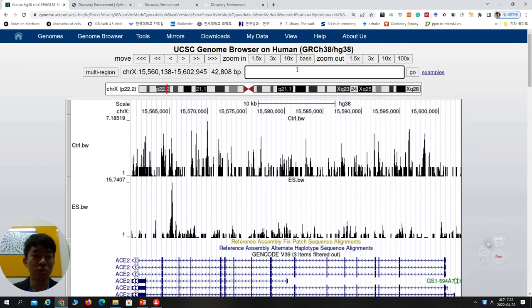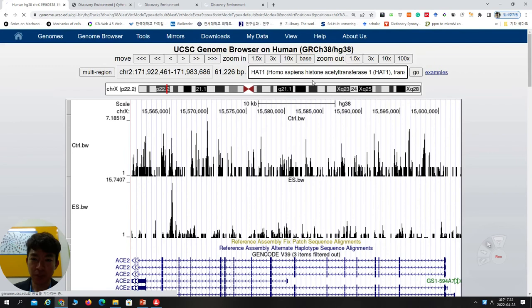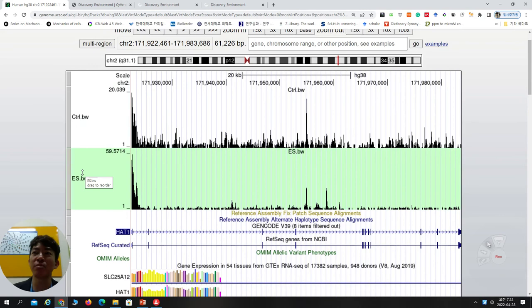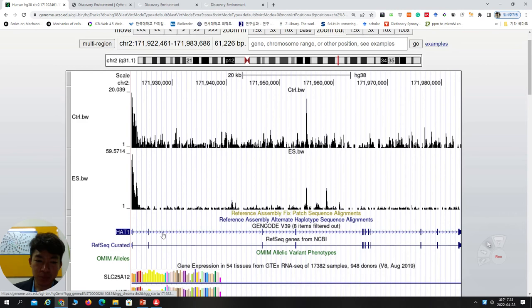Which gene do you want to see in your mind? Shanika, which gene? — HAT. Okay, let's type 'hat.' They can show HAT1. Click it and go. So this is HAT1 — this is data from ATAC sequencing. ATAC sequencing means when certain genes are open, the ATAC sequencing peak is higher. More value means more chance to be expressed. But this HAT is not clearly shown at a glance, so we can use zoom out.